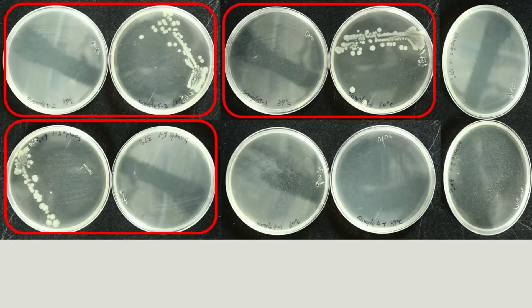Here is the result. Three out of five picks can grow under 65 but not 37, and two of them didn't grow anything somehow. I think this is good enough since I did find thermophiles from normal soil.